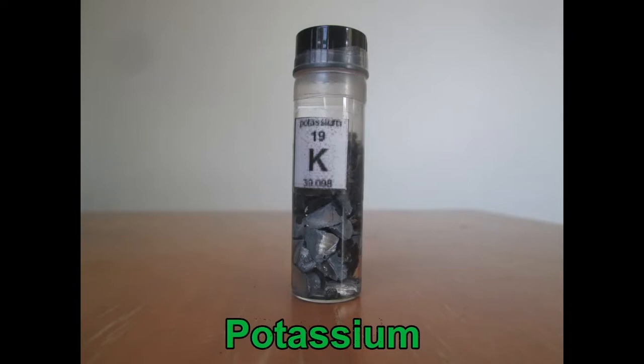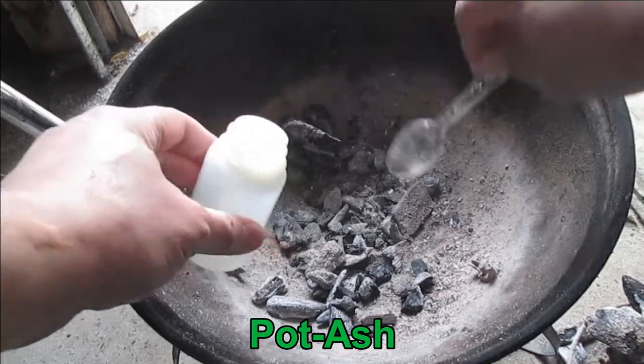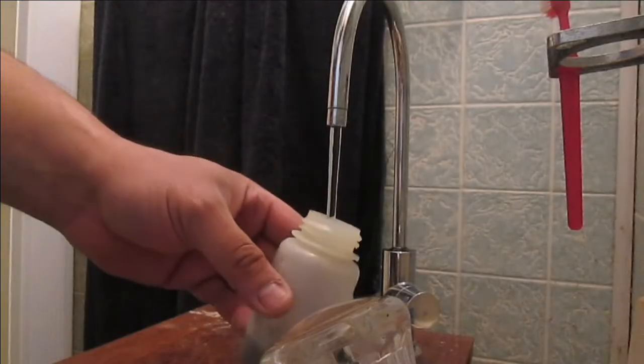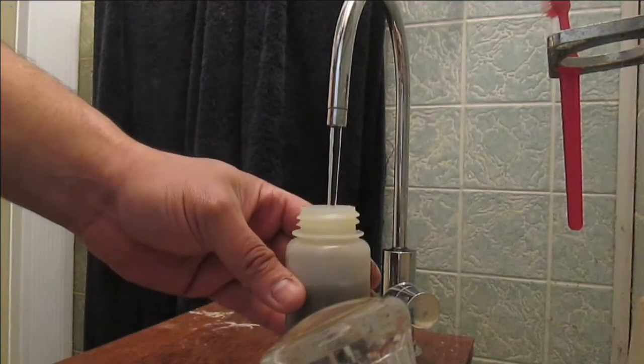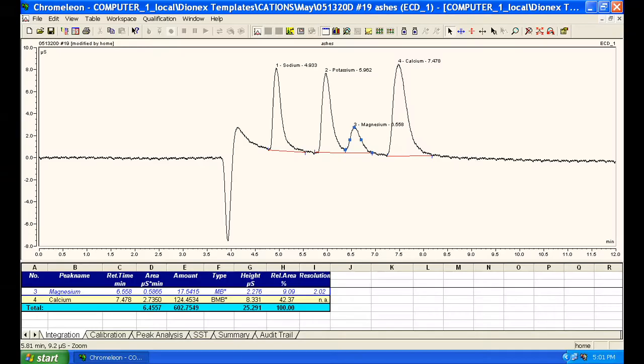Speaking of potassium, here's a quick bonus fact: the name potassium is derived from pot ash, because of the alkaline ashes left over after burning wood or vegetation. After dissolving some ashes from my grill in deionized water, the pH increased, and potassium is very much present, even at 1:100 dilution.